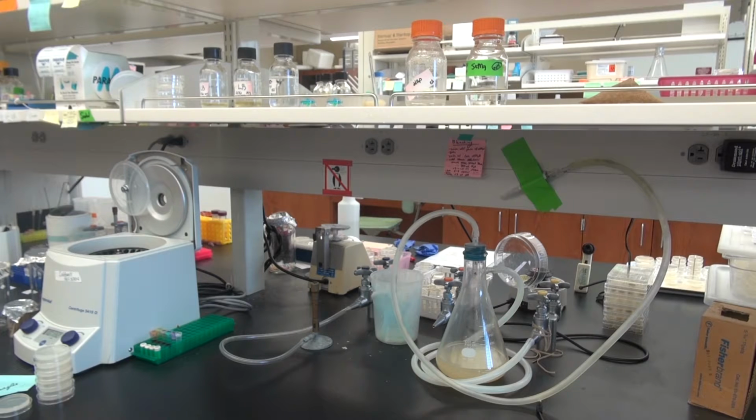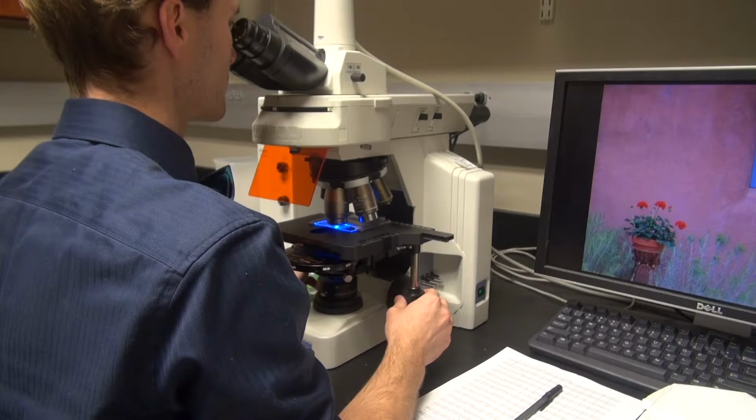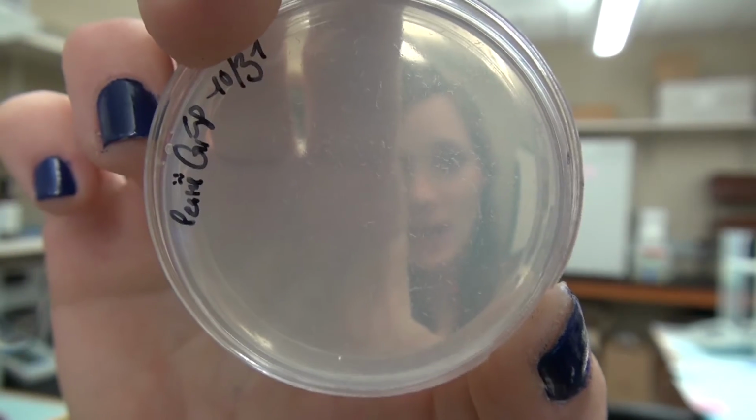When some people think of science laboratory testing, they think mice. But this isn't the case for the Caldwell lab. They use an organism that's much smaller. There are thousands of roundworms on here called nematodes. They are so small you can barely see them with the naked eye. Dr. Caldwell's lab is nicknamed the Worm Shack because he uses these worms in his research.